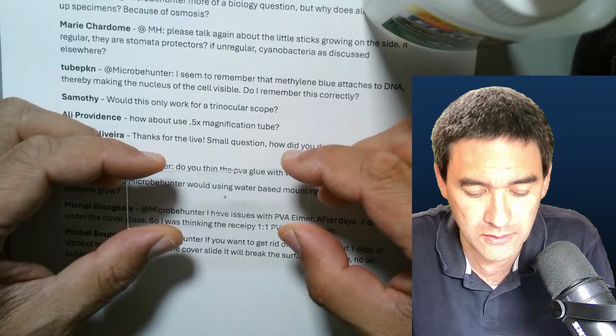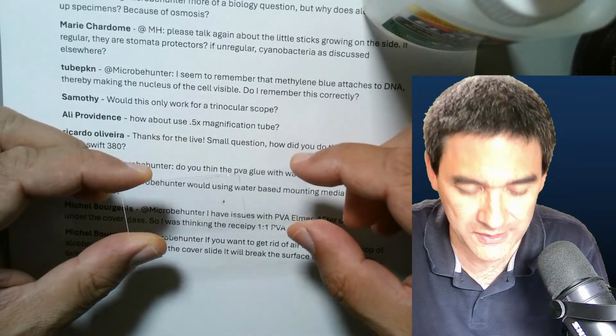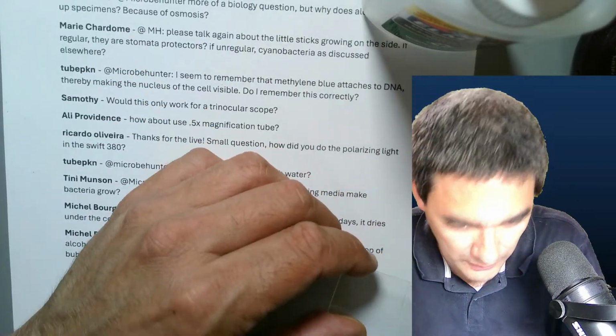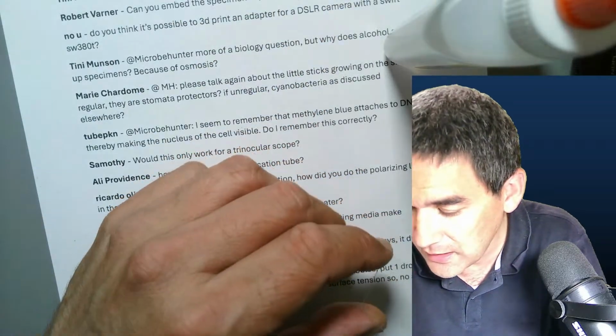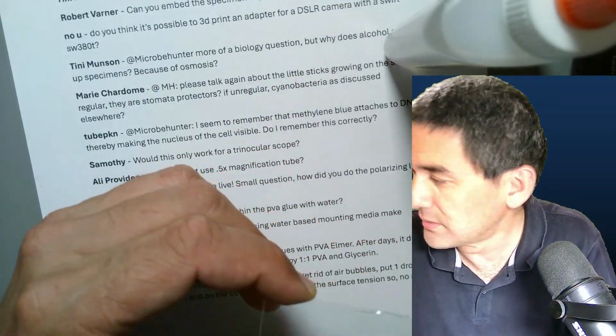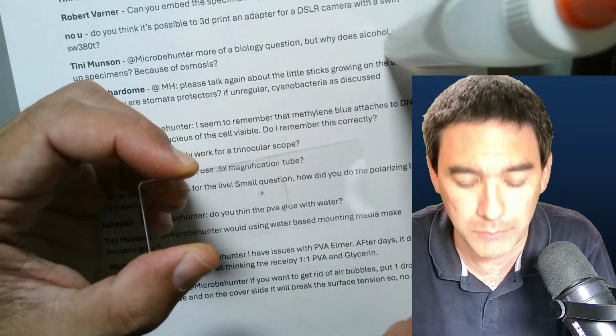That could also be a possibility. Yeah? But indeed, there are several ways how you can deal with air bubbles. And I'm going to wait now until next week, and we can have a look. I don't even know where I put the slide. We can have a look the next week again how well this will have worked, and if there's still some bubbles present.